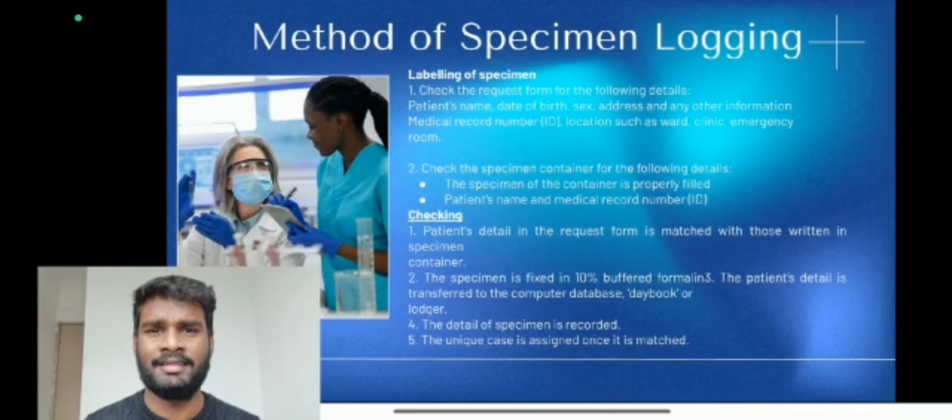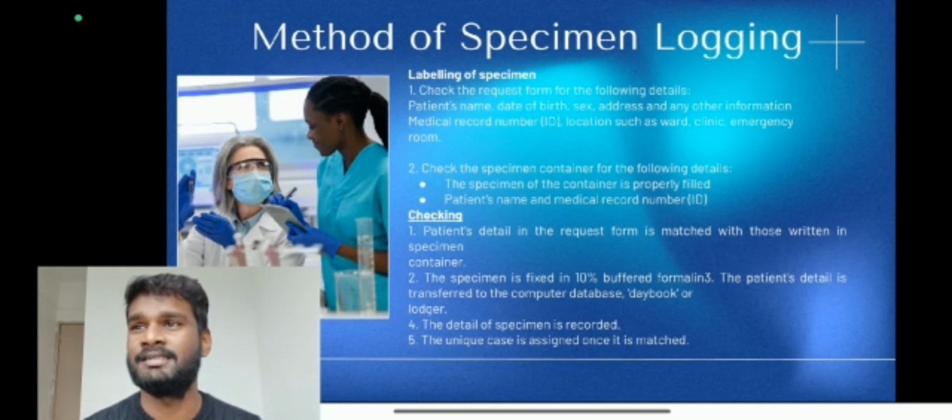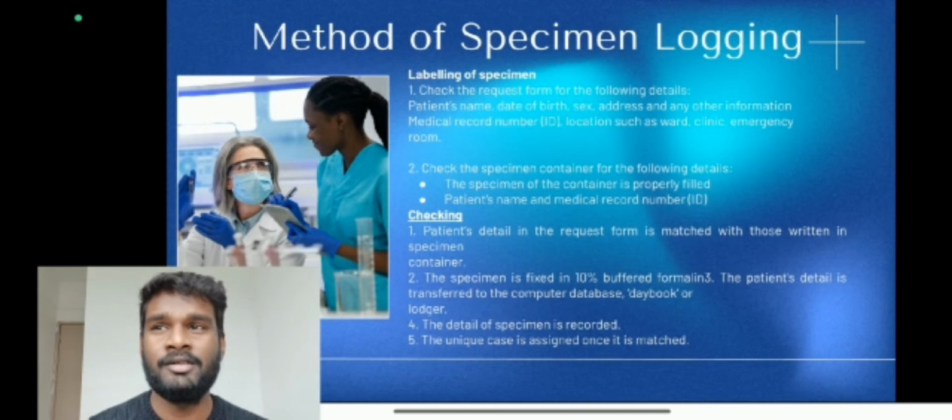Moving on with the presentation, I would like to start off with the very first step of histopathological techniques, which is known as specimen logging, or in other words, collecting specimens among histopathological researchers. Methods of specimen logging stem from labeling of the specimen.